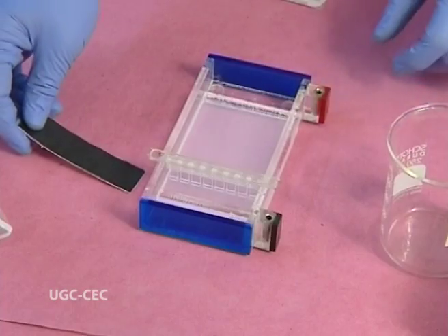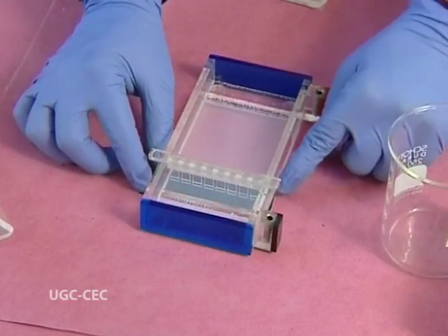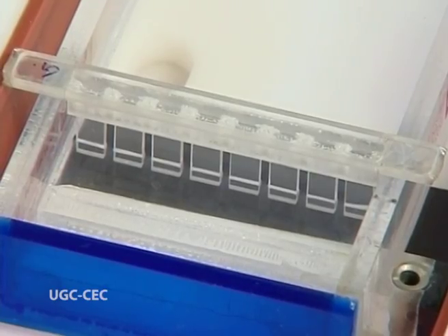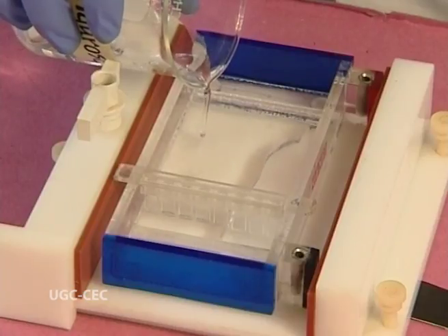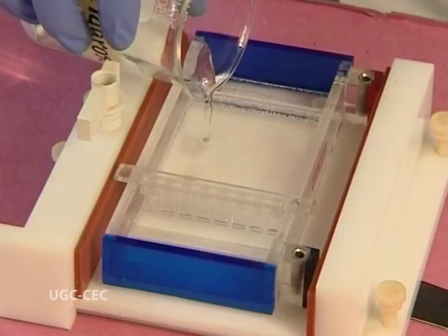Now let me make it clear that before loading the wells, we need to make the background dark so that the wells can be seen clearly and the loading gets easier. And then we pour the gel into it. We allow it to condense for 15 to 20 minutes.